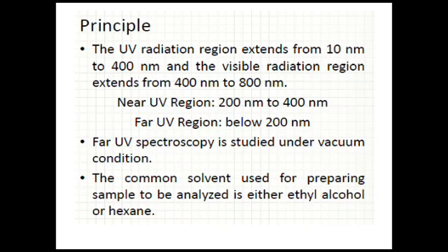The principle: the UV radiation region extends from 10 nanometers to 400 nanometers.